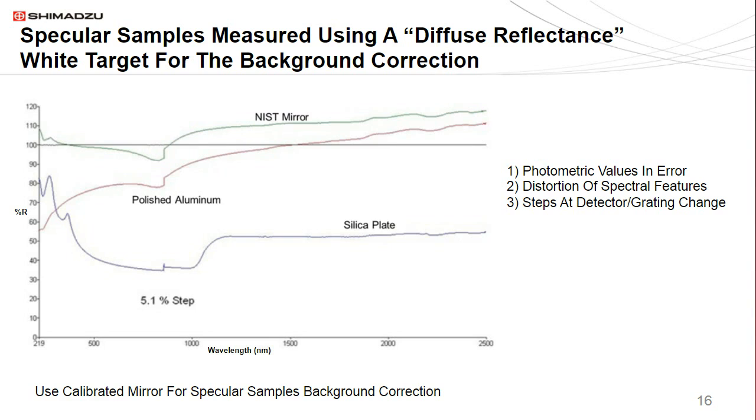What you're doing is you're attempting to duplicate the hot spot inside your sphere with your background correction and therefore cancel it out. It's not the most perfect way to do it. But it will work, and many people have used this. The closer your mirror for the background correction is to your sample, the better your data is going to be.